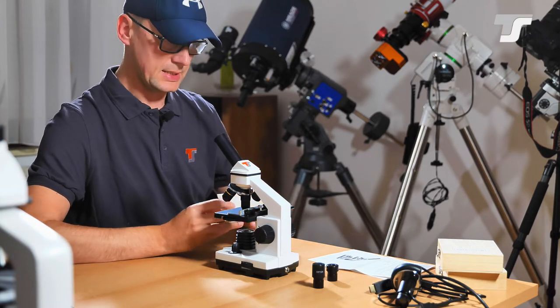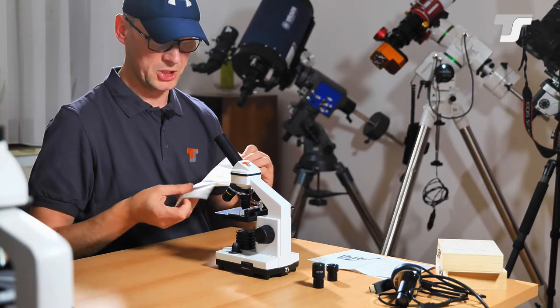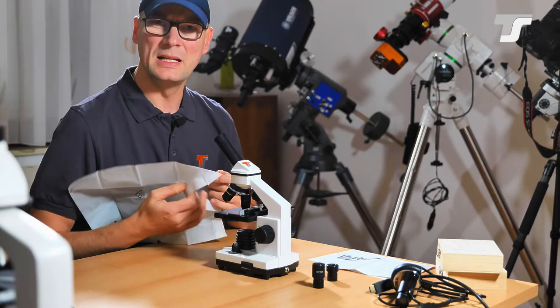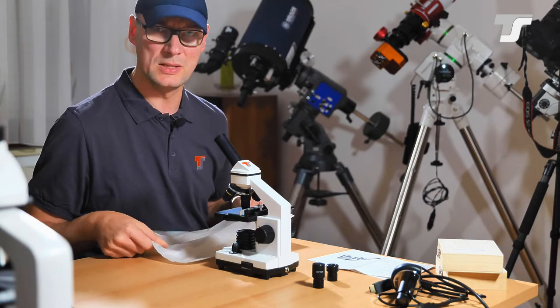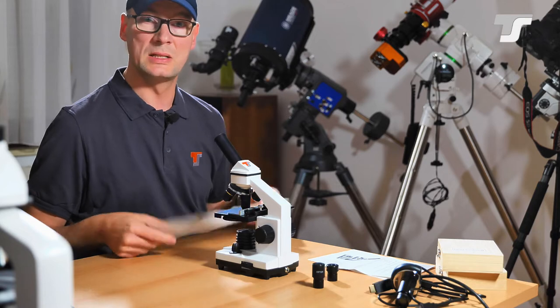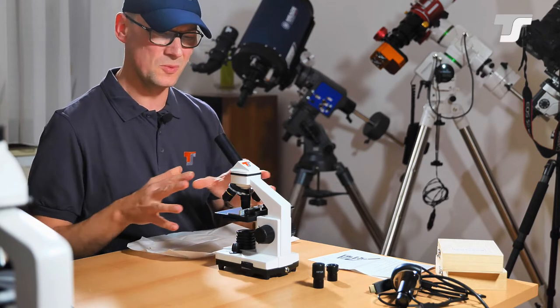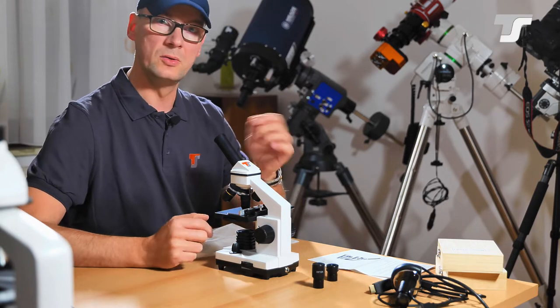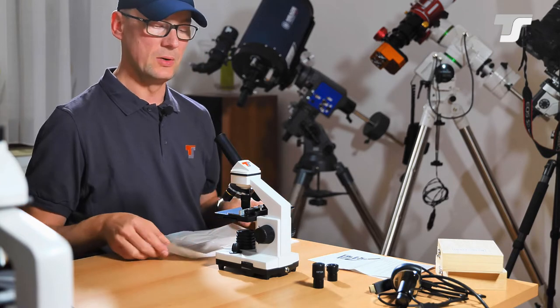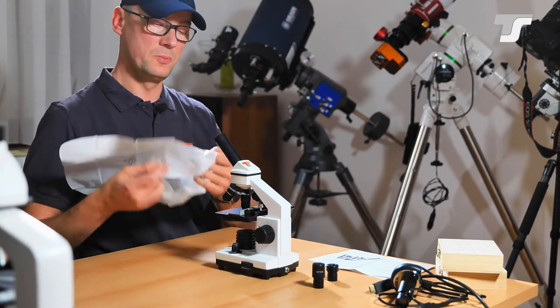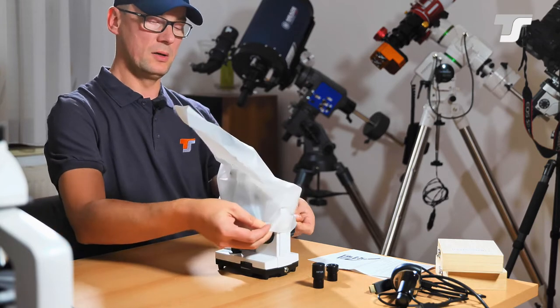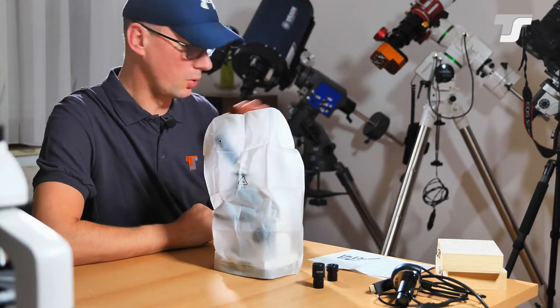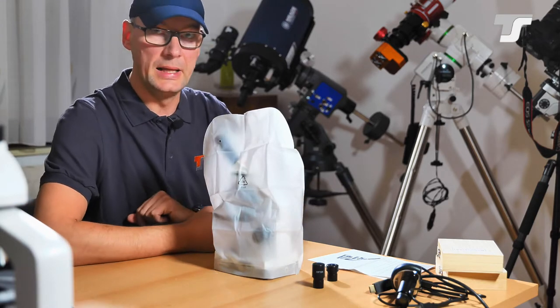Another thing in the box is this pouch here. This is maybe you have seen these pouches standing around in laboratories or somewhere. This is just used to cover it from dust. These microscopes are collecting dust like nothing. It's incredible. And you need a brush or something to clean them. So it's far more easy to put this pouch, this bag, over it when you're not using the microscope. And you don't want to put it back in the foam box.